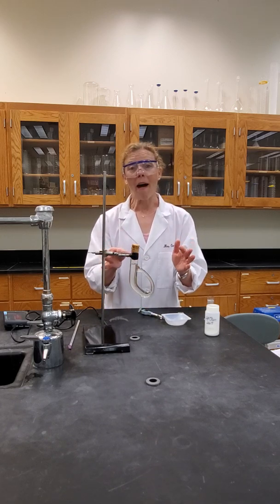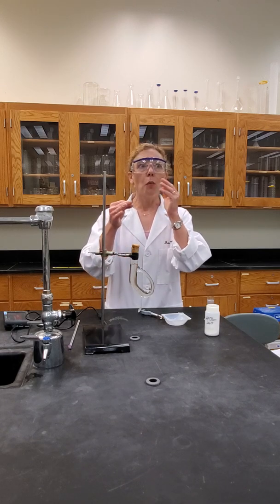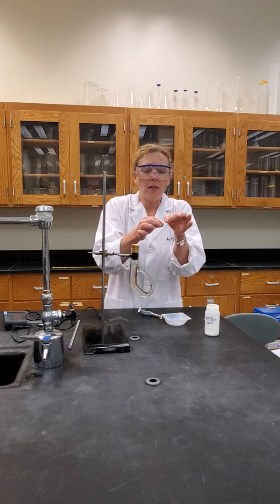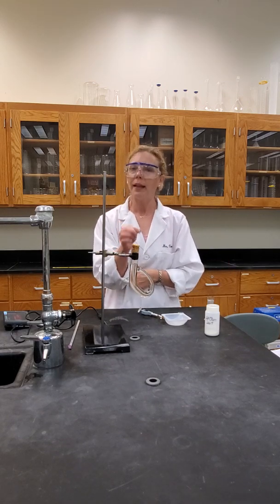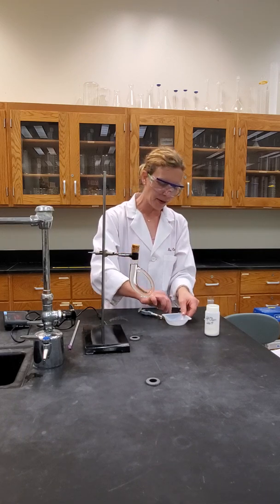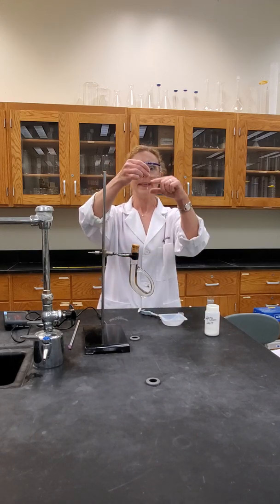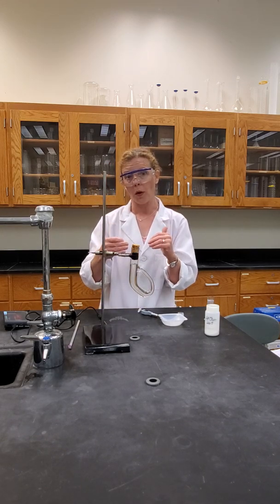Now, I want to remind you guys, you're super, super strong, and we want to be really careful in handling these capillary tubes. We do not want to hold them so tight or tap them so hard that the walls crush or break, and then you could possibly cut yourself with the broken glass. So scoop and then just tap to make sure it's collecting at the bottom. Scoop and tap. Oh my gosh, that's a good 1/2 centimeter. I can definitely see that. And it'll be magnified a bit when you lower it into the mineral oil.